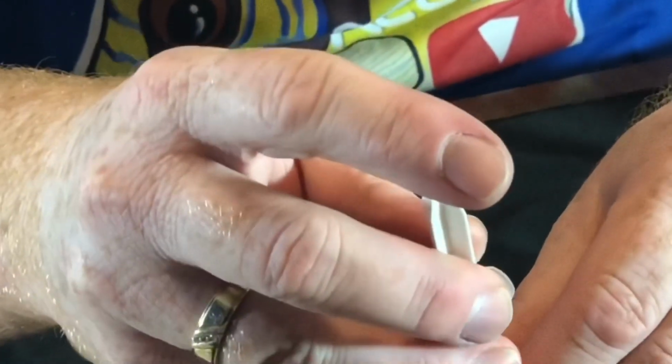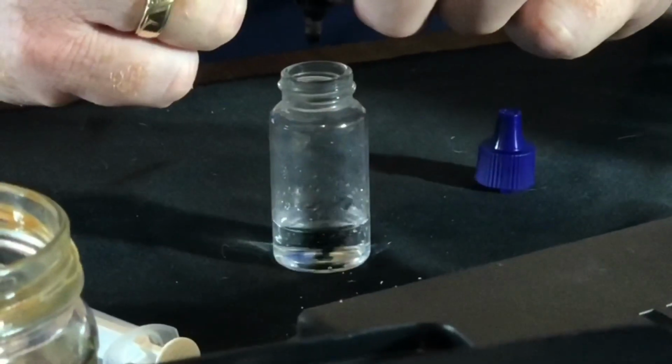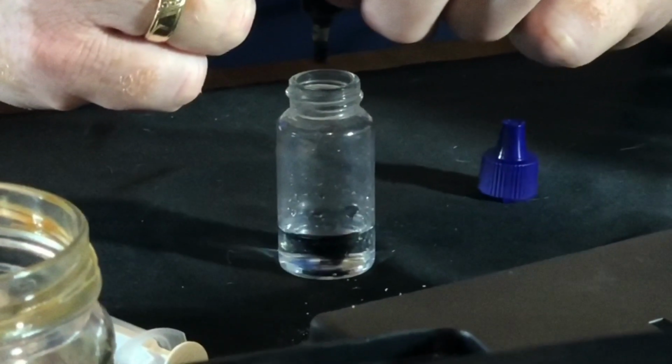Alright, next is your pH. Grab yourself another clean vial. This time you need 5 mils of salt water from your tank, obviously. And you put 3 drops of the reagent. 1, 2, 3. Give it a shake for 10 seconds.